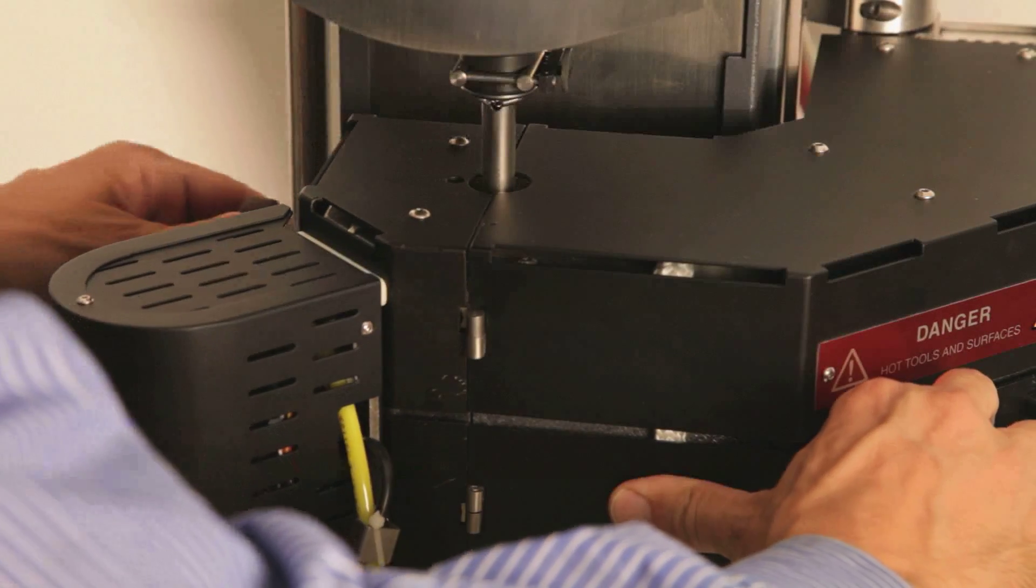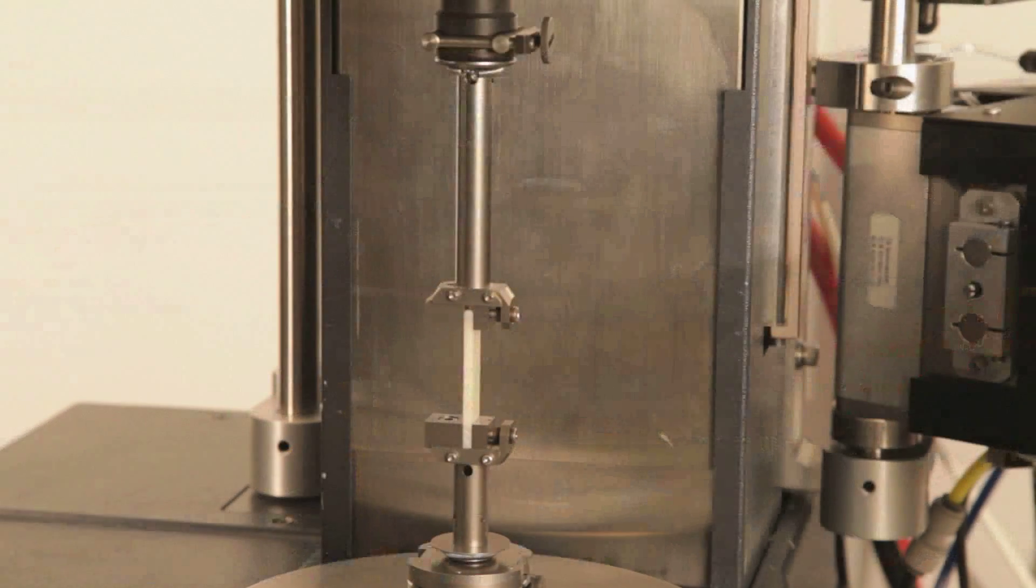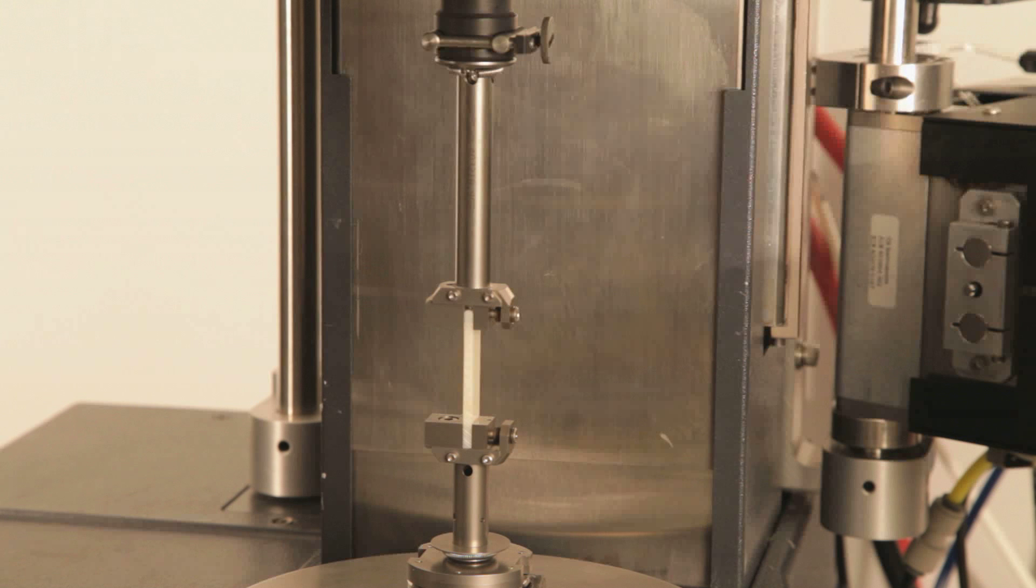The torsion fixture is now installed. The sample is loaded and held under a tension force. You can now proceed with setting up your test procedures and equilibrating the temperature for your polymer application.